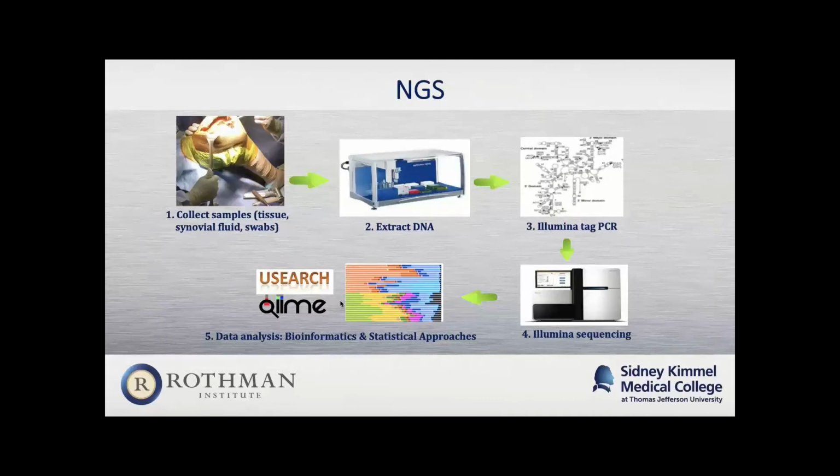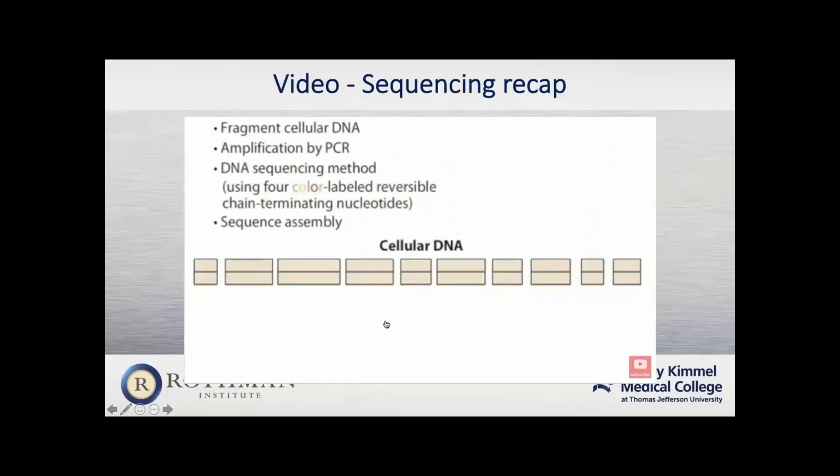So irrespective of which of these two techniques is employed, the general pipeline follows this pathway. Samples are collected, DNA is extracted, and then, for example, for the Illumina MiSeq, the DNA is tagged using custom adapter sequences, and then amplified on a solid surface with covalently attached DNA linkers, and then loaded onto a pipeline such as the Illumina MiSeq, and then reads generated are compared against a curated library to enable taxonomic classification.